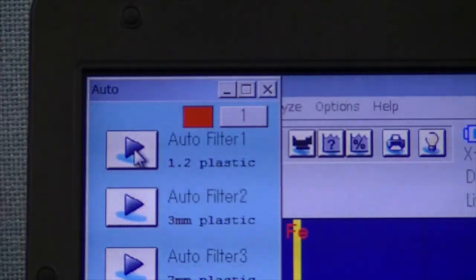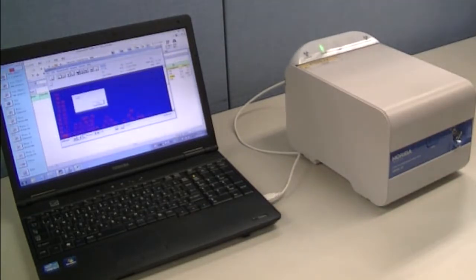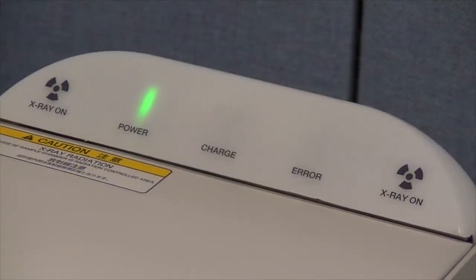Just click the button of your choice for the measurement. The best condition is automatically selected according to your requirements. When the measurement starts, the red lamp shows you that x-rays are being emitted inside the instrument.